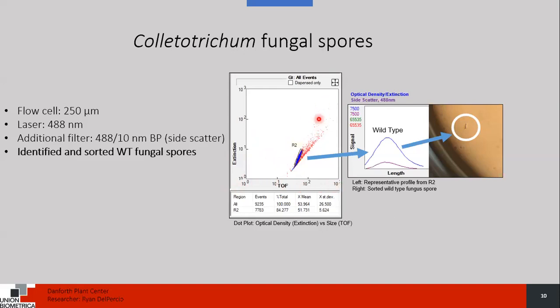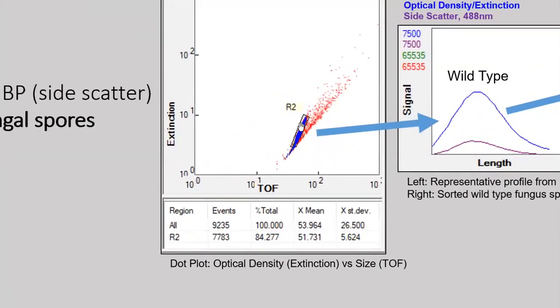And you see this kind of distribution of signals. And if we zoom in, we see that this area that's blue, what happens is that each red dot is a single event. But when you collect here, we've collected 9,000 signals.